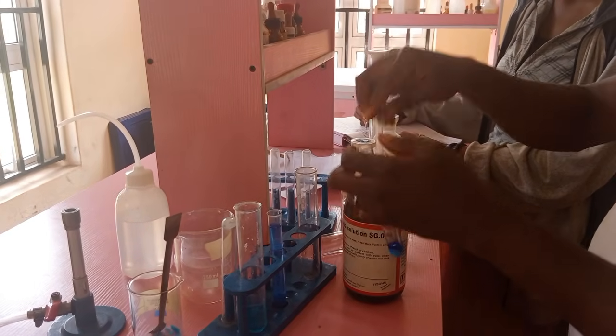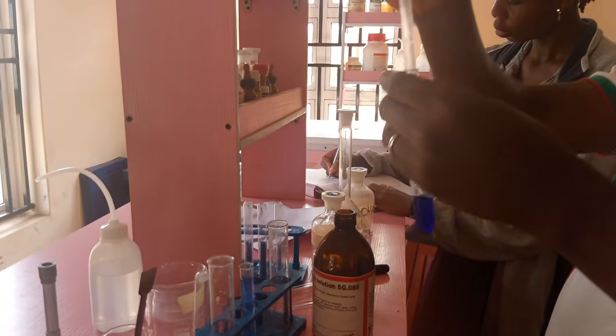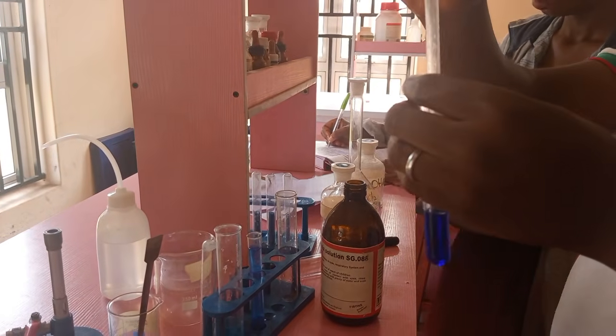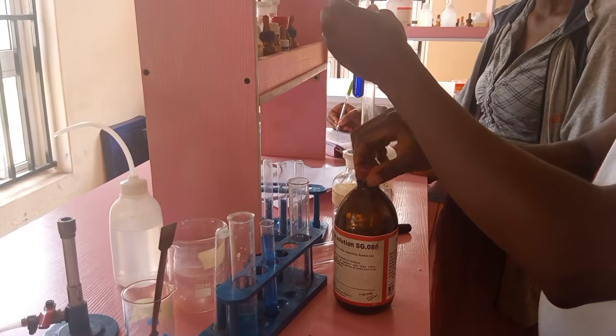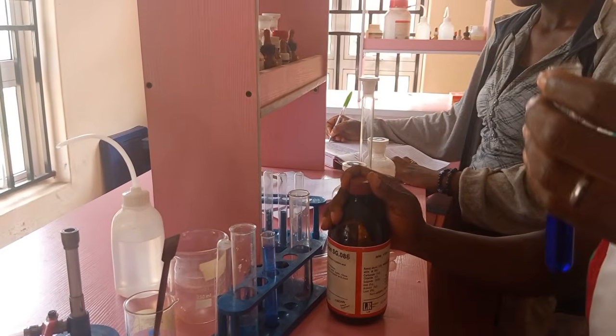Let's add in excess. Okay. So can you now see what you have? Is this one light or deep blue? Deep. Okay. So you have deep or royal blue.